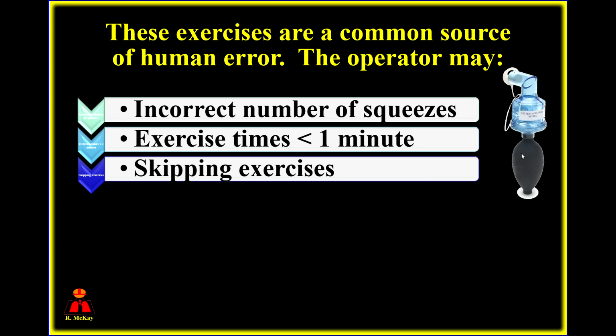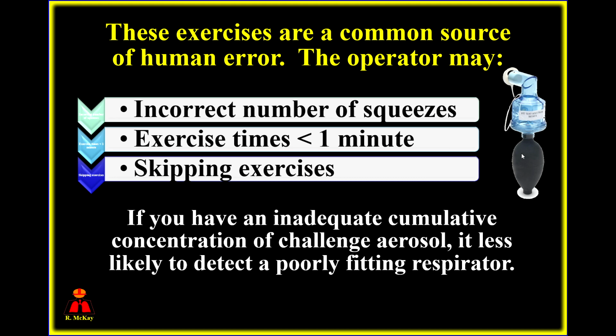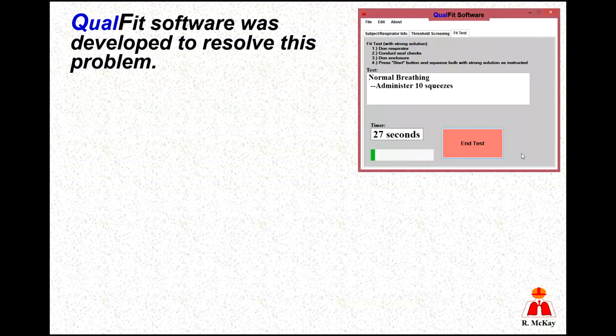So these exercises are a very common source of human error because the operator may use an incorrect number of squeezes, not conduct the exercises for the full 1 minute, skip the exercises, etc. The point being that if you have an inadequate cumulative concentration of the challenge aerosol, it is less likely to detect a poorly fitting respirator. QualFit software was developed to resolve this problem.